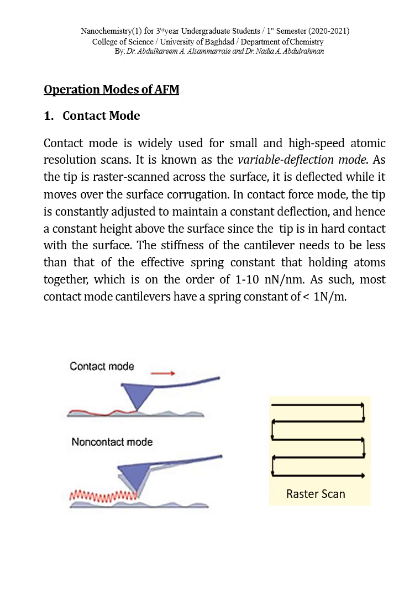بالمحاضرة السابقة ذكرنا إنه التب for AFM never touch surface of the sample. طبعا هذا هو general speaking وهو فقط بال non-contact mode. However يوجد مود آخر للعمل به بال AFM اللي هو ال contact mode. So operation modes of AFM: number 1, contact mode.